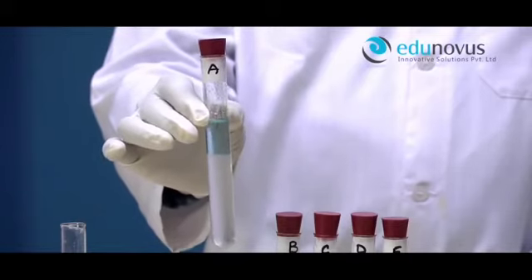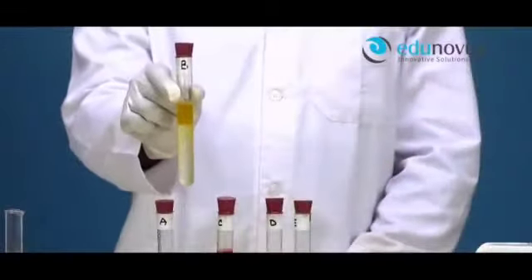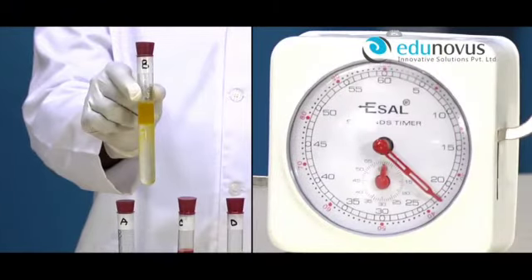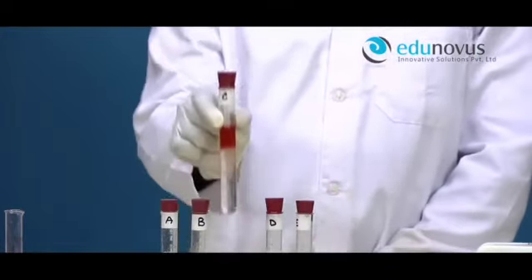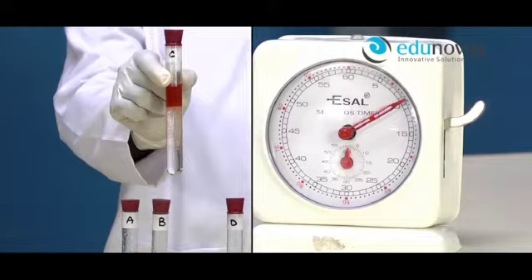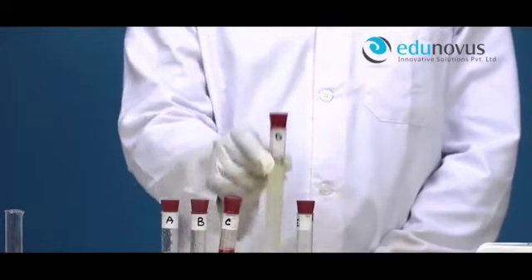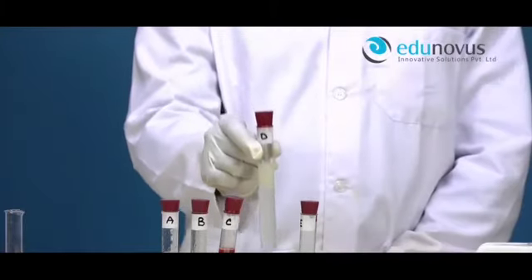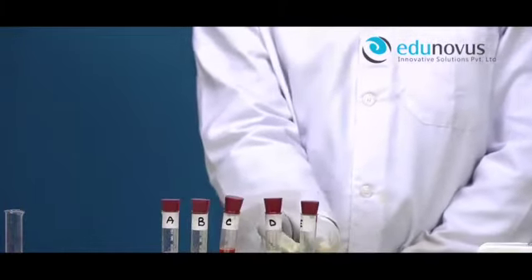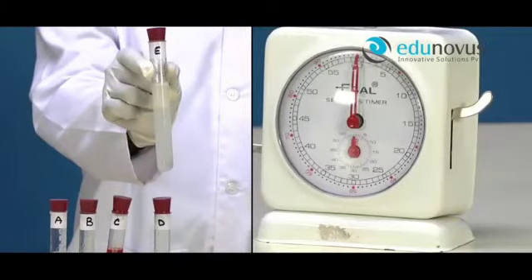Now similarly, repeat the procedure and note down the times taken for test tubes B, C, D and E. Time taken for test tube B containing mustard oil is 23 seconds. Test tube C containing machine oil is 10 seconds. Test tube D containing castor oil is 30 seconds. Test tube E containing coconut oil is 60 seconds respectively.